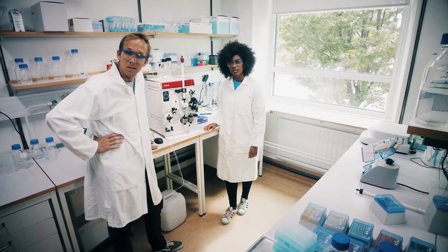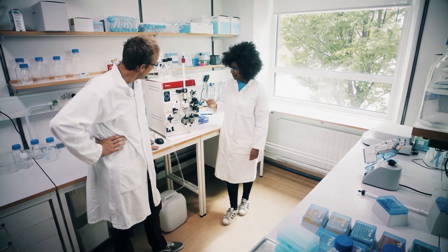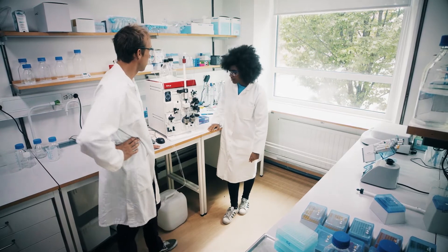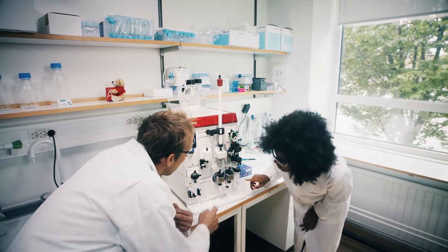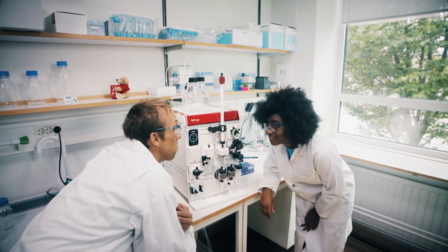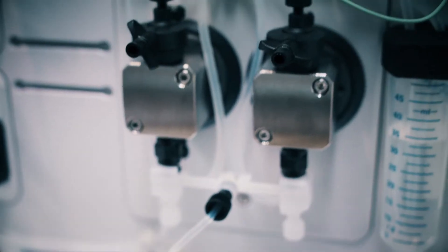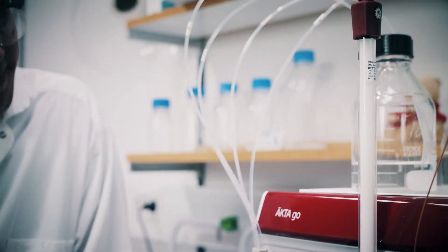ÄKTA go is really compact, but it is good to know that it still has all you need to run your pre-packed columns and resins. It has a reliable system pump and a compact inlet valve for sample application and gradient formation. The short and optimized flow path decreases dead volumes, minimizes band broadening, and increases the resolution of the run.